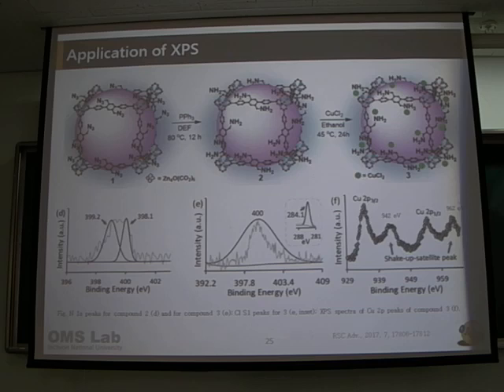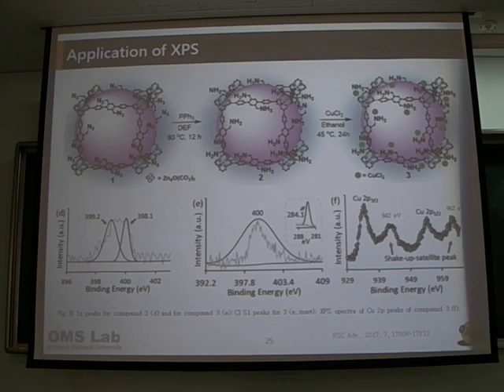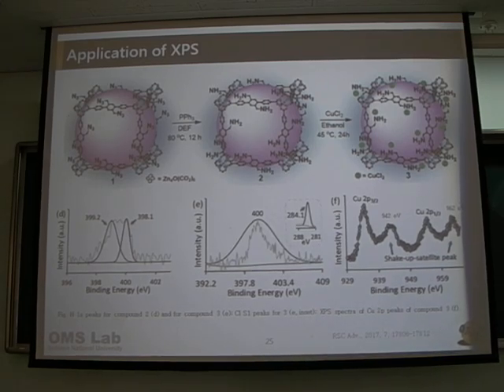Yeah, we do this at 800, and this, for example, is 750. Then in this case, a little bit like this. These two are almost similar, but 3. This is the weight loss. This is the weight loss. So in this case, this is compound number 3, and this is number 1. And I'm asking, that is due to what? Degradation or what? We hope that this one, after modification, doesn't contain the metal copper, then the weight loss in this case is a little bit less than this one.